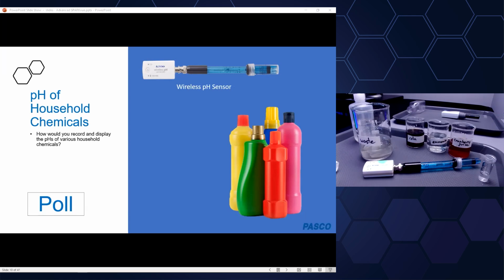All right, so one option here, you'll need to hover over it to see the entire response, but one is graph the pH, record a single run, moving the sensor between chemicals during the run, and then annotate with the graph's annotation tool each section of a run with its chemical name. All right, that's a viable way to do it.